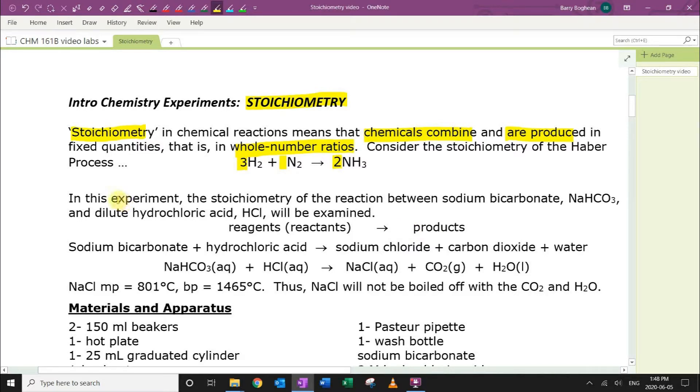In this experiment, we're going to look at the stoichiometry of the reaction between sodium bicarbonate, NaHCO3, that's ordinary baking soda, reacting with dilute hydrochloric acid, HCl.